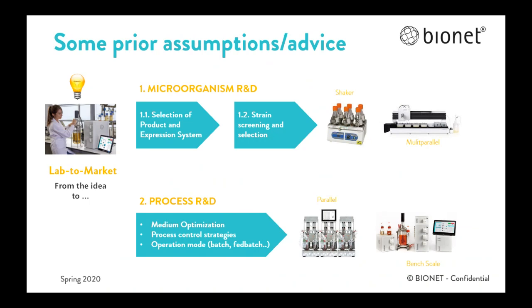It uses the same components as the lab testing, like pumps, which are often standardized and can be used in many other mini plants. Operated continuously for weeks or months, so some automation is required. It is used in combination with process modeling and simulation of the industrial scale process.